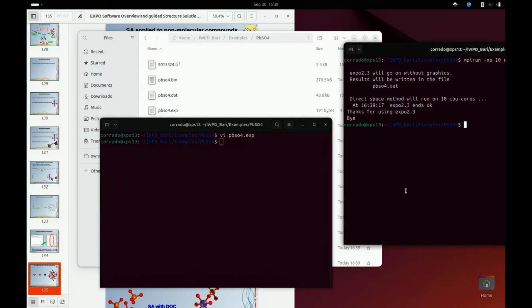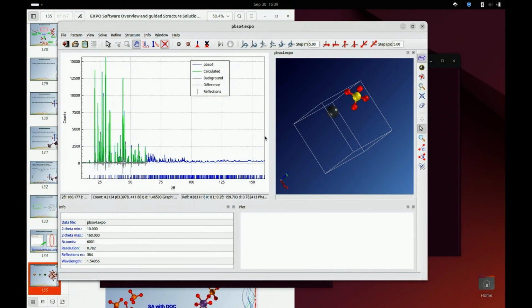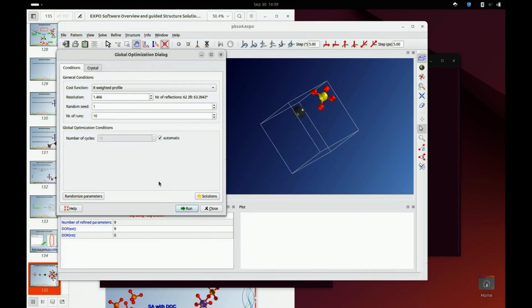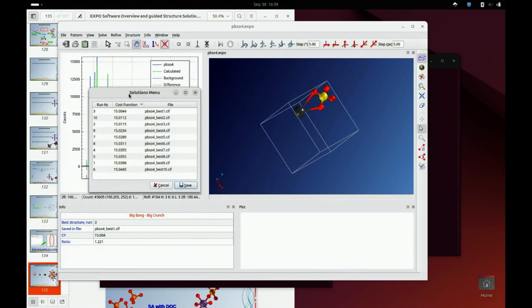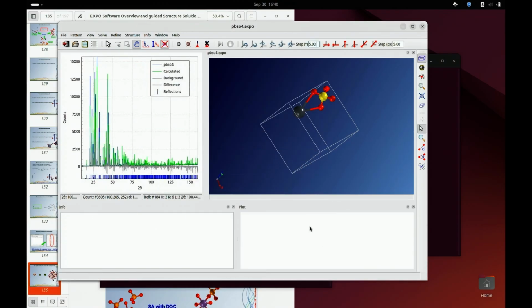So at the end, the program generates the project file and the export. And just this solution. Remember, you can access all the 10 solutions from the bottom solution button.